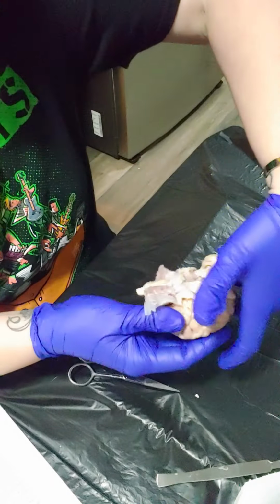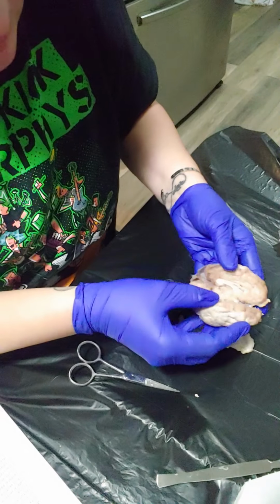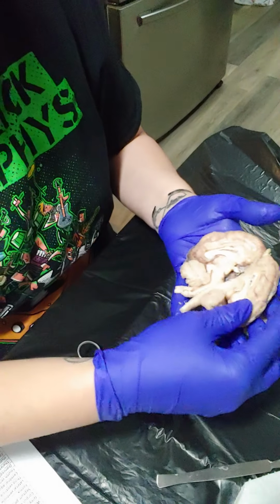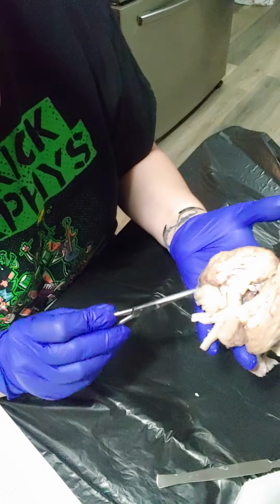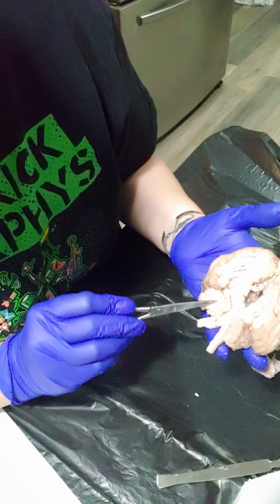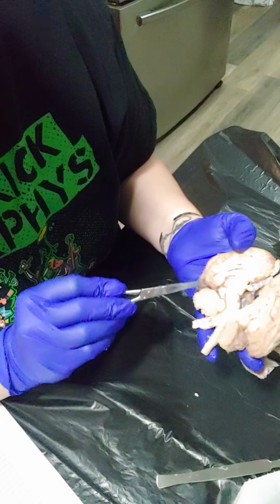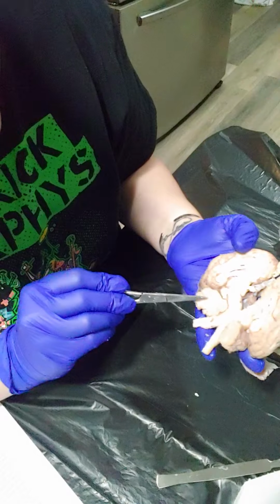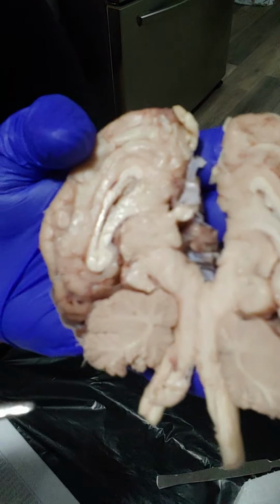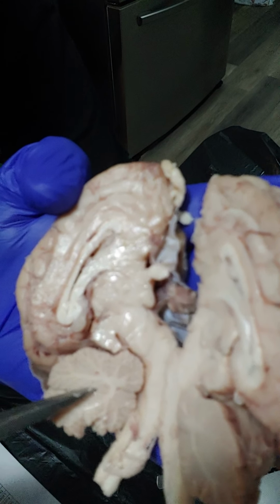White matter. White matter is white, gray matter is gray. But I'm going to go ahead and split this in half. So, really easy way to see it. This right here is going to be your white matter. Okay, white matter. And then the darker is going to be your gray matter. That's a horrible glare, but let's see. White matter and gray matter.